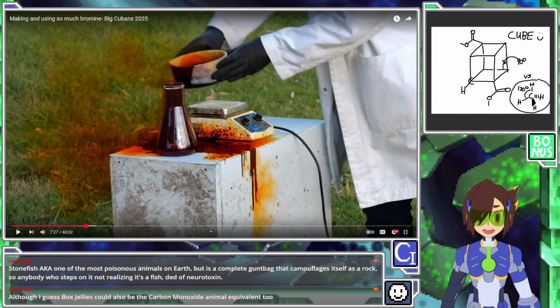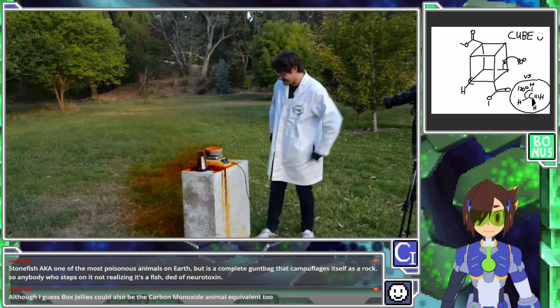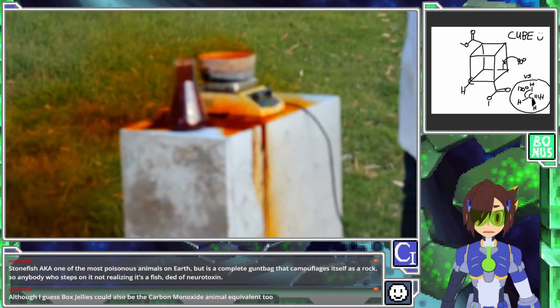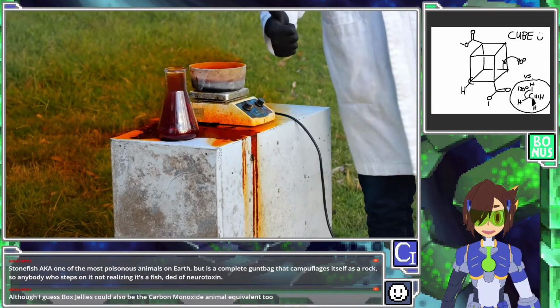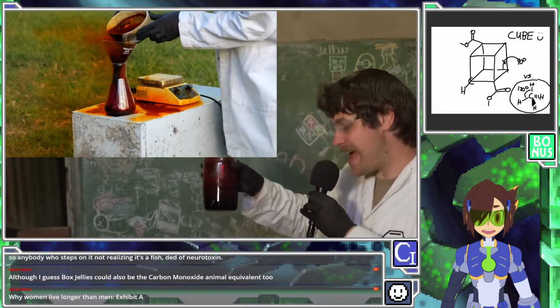Oh my god. Stop. Sorry, my pouring skills aren't... I can't believe they're this calm. You're so right. So, it's pretty contaminated. So we will just have to redistill. Oh, now he gets the funnel.